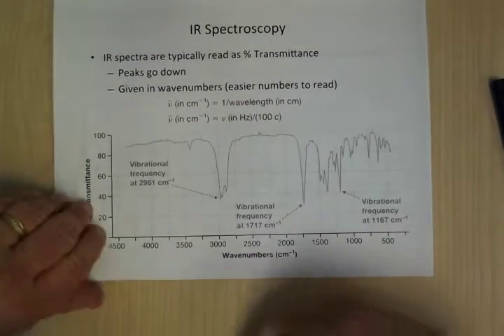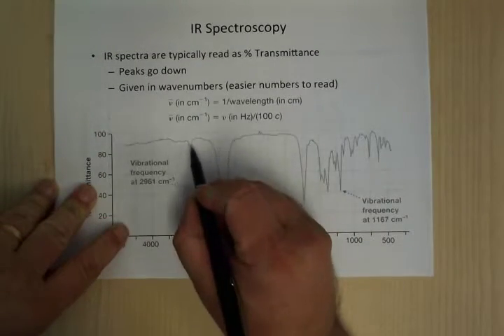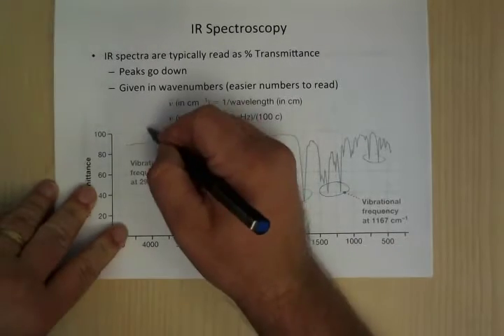They're like stalactites. Here's a peak, here's a peak here, peaks there. And this is the baseline.